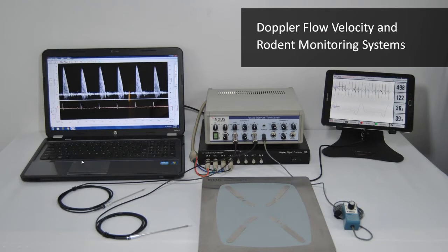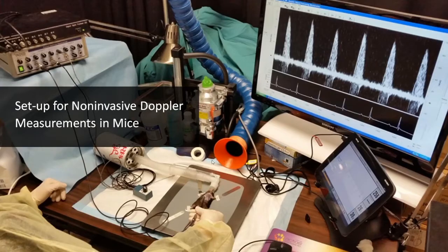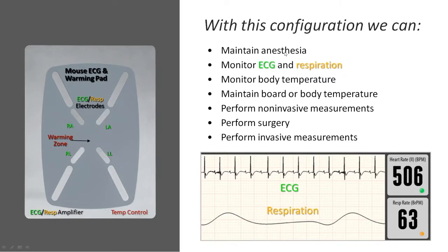This is a typical Doppler system combined with a temperature monitoring system. Here you can see a typical setup — the mouse is anesthetized, taped to the electrodes on the board, with a probe held to the zephoid process aiming towards the ascending aorta. You can see the signal on the screen and save it. The board is used to maintain anesthesia, monitor ECG for mice or similar sized animals, monitor and maintain body temperature, and perform non-invasive measurements like Doppler. It's also useful for surgery and invasive measurements as well.